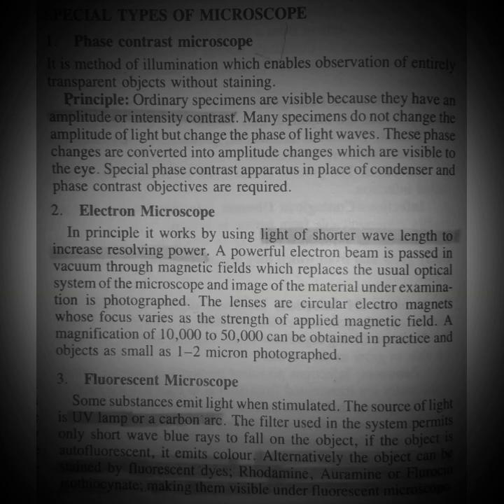Now last is the fluorescent microscope. In the fluorescent microscope we use a source of light like a UV lamp and carbon arc. Alternatively, the object can be stained by fluorescent dye. So in this microscopy, firstly we prepare a slide, and that slide contains the fluorescent dye. Examples of fluorescent dye are rhodamine, auramine, and fluorescein isothiocyanate. So these are used in the fluorescent microscope.